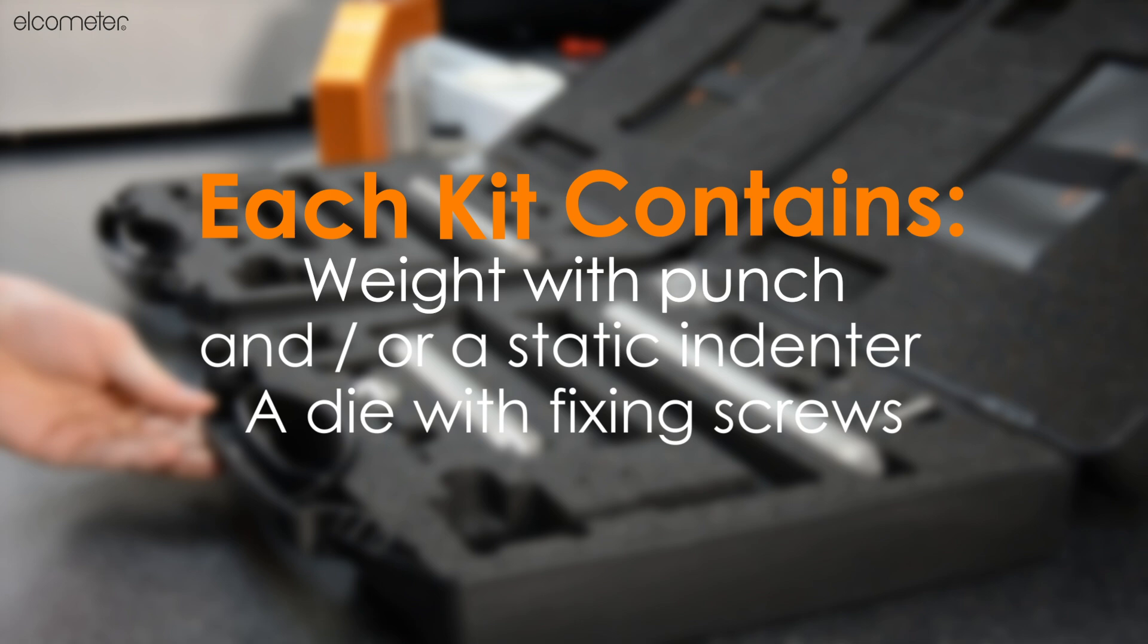Each kit also includes a die with fixing screws. The die essentially acts as a guide for the punch, ensuring a consistent and repeatable impact.